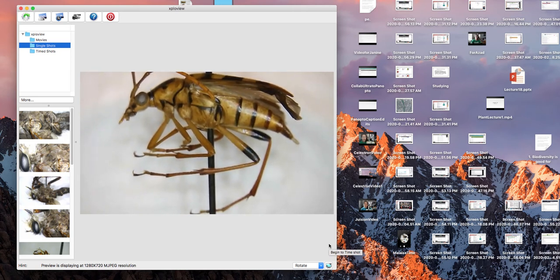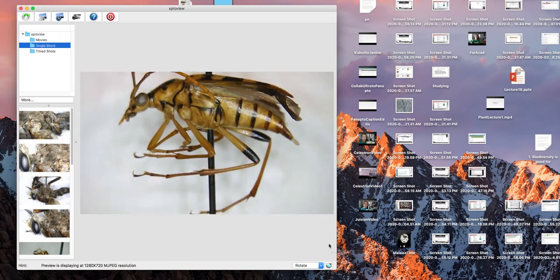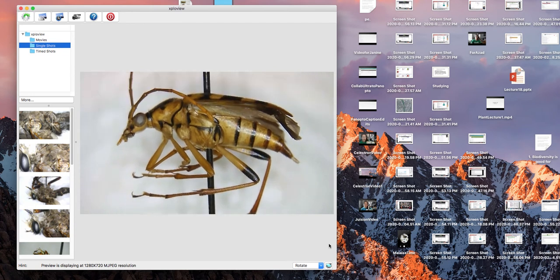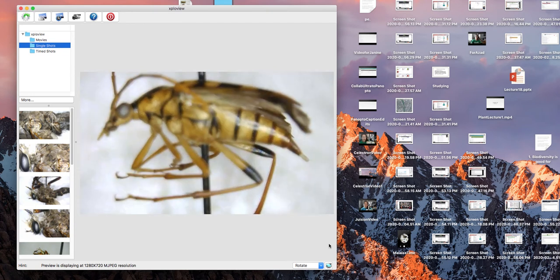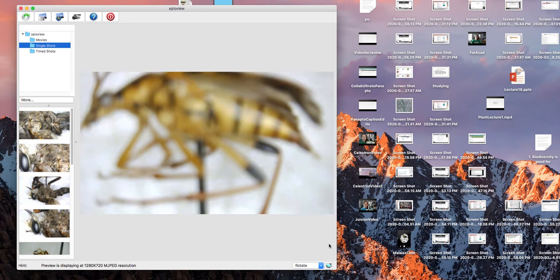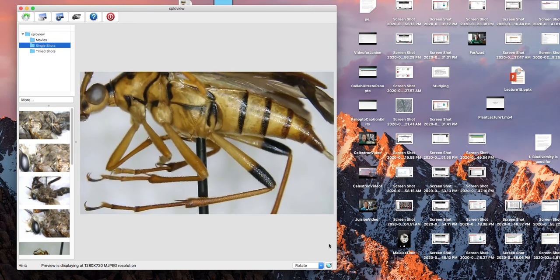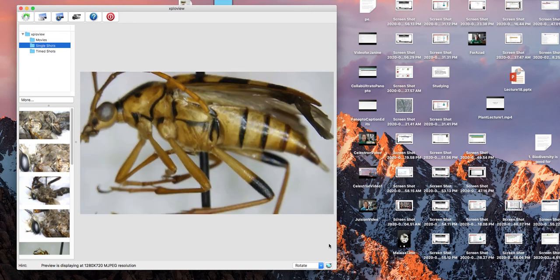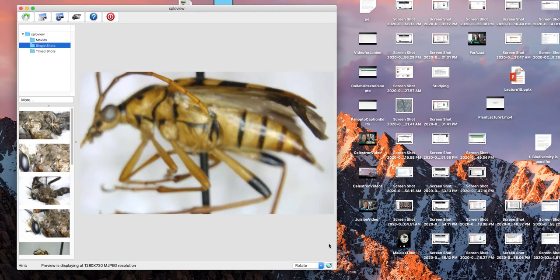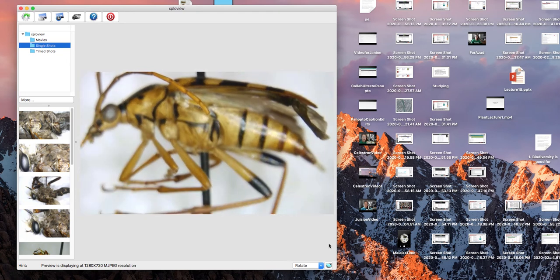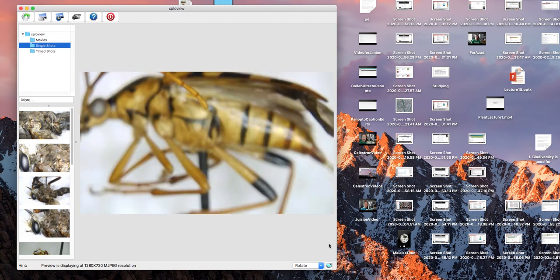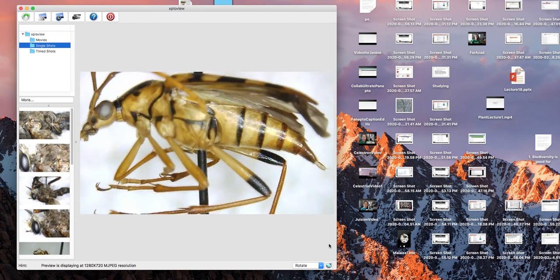Zooming in on this, I can also raise the color a bit, make it a little bit brighter. Certainly I can bring the microscope down further if there's something I want to zoom in on. And then I'm using the fine focus here, raising and lowering using the coarse focus to raise and lower the head on the microscope. And now I'm using the fine focus.